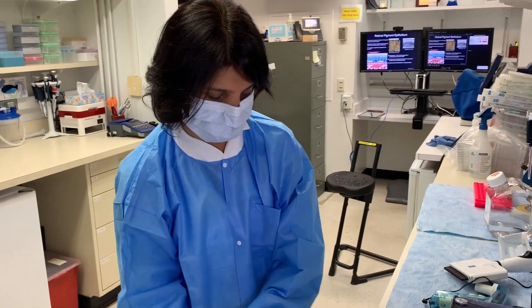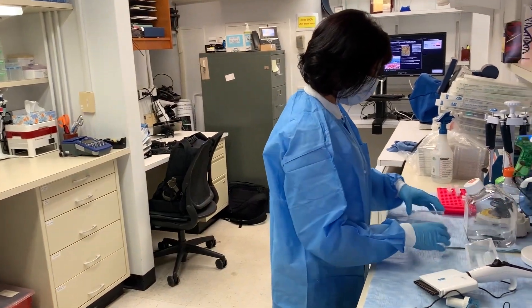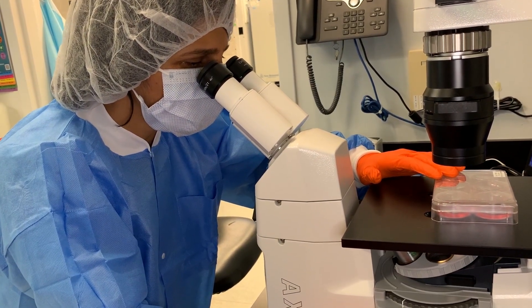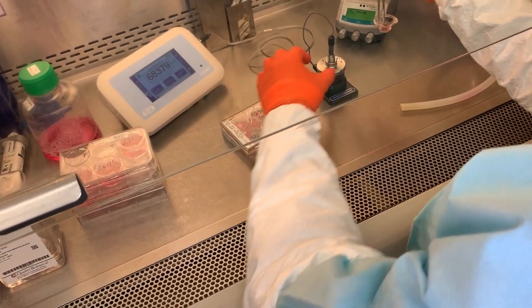The entire protocol of making RPE from iPSC takes almost 10 weeks. The protocol has also included quality control assays for all the crucial steps so that you can check the efficiency and the quality of your differentiating RPE cells.